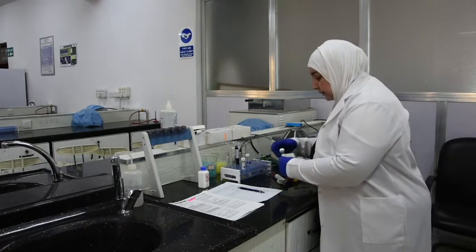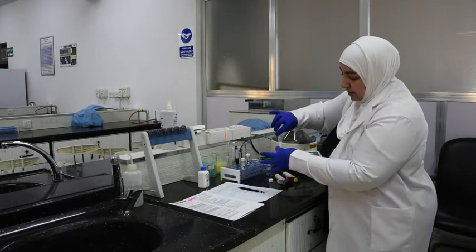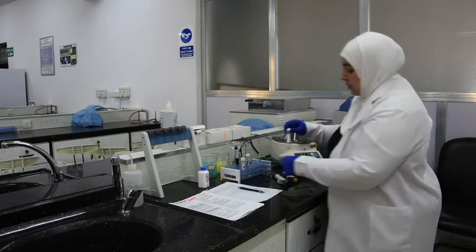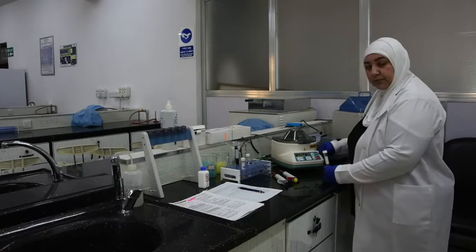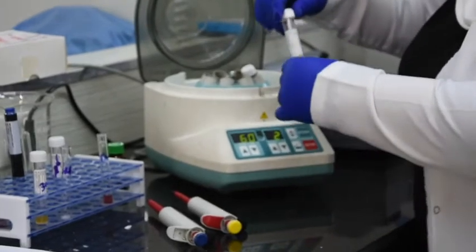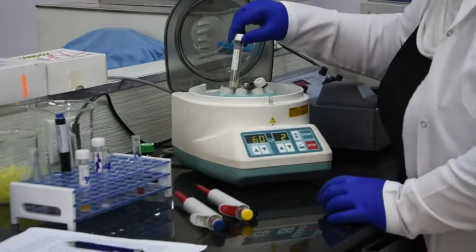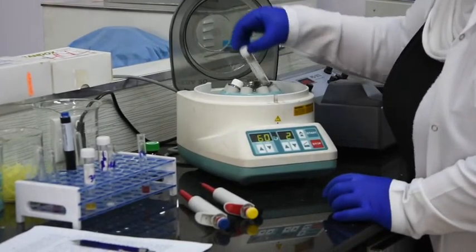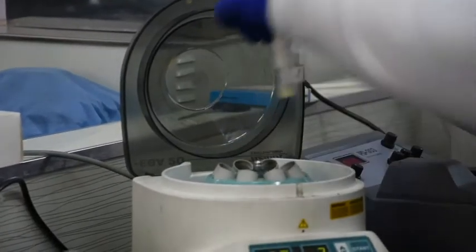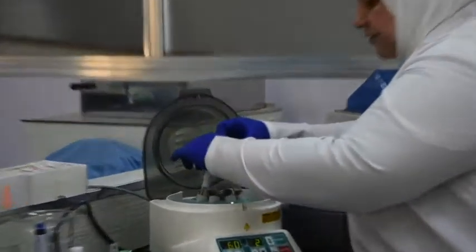Then transfer it into a plain tube, a plain tube. We must put it in the centrifuge. We open the centrifuge like this. This plain tube has the serum and HDL reagent. We must balance the centrifuge with another tube that has the same amount of liquid. You see? The same amount of liquid keeps the centrifuge balanced.